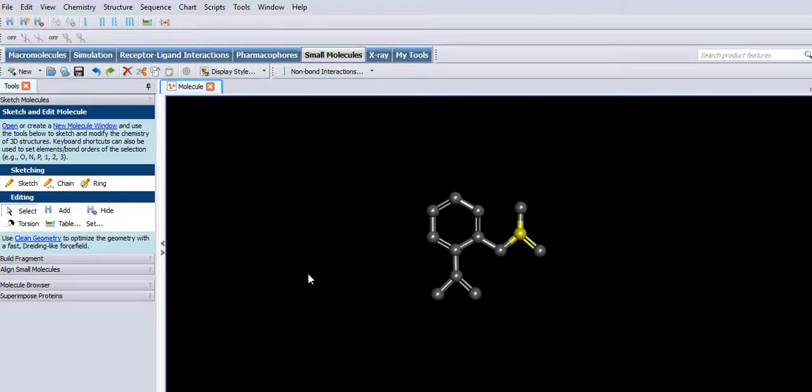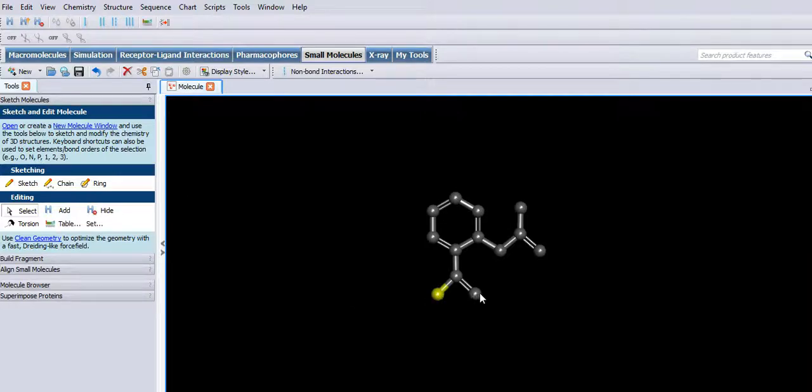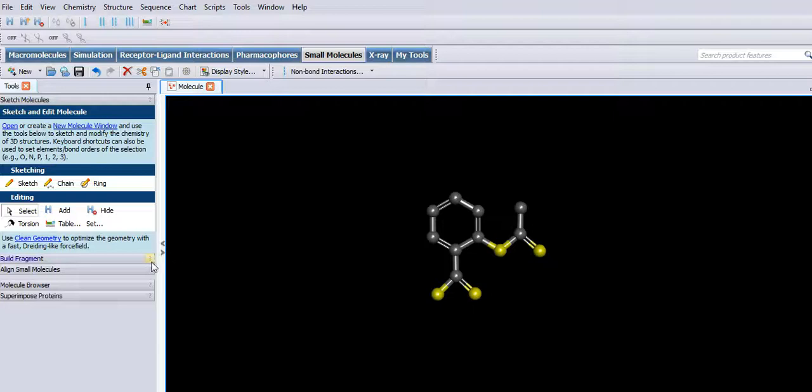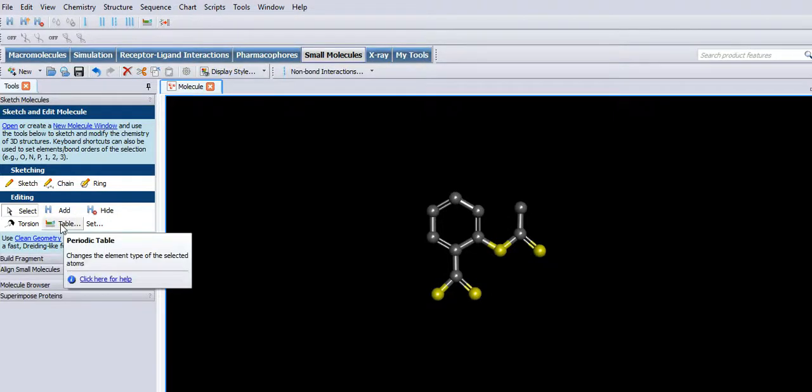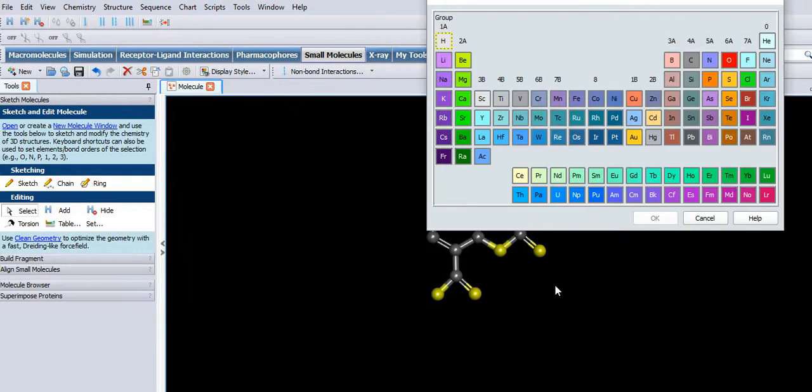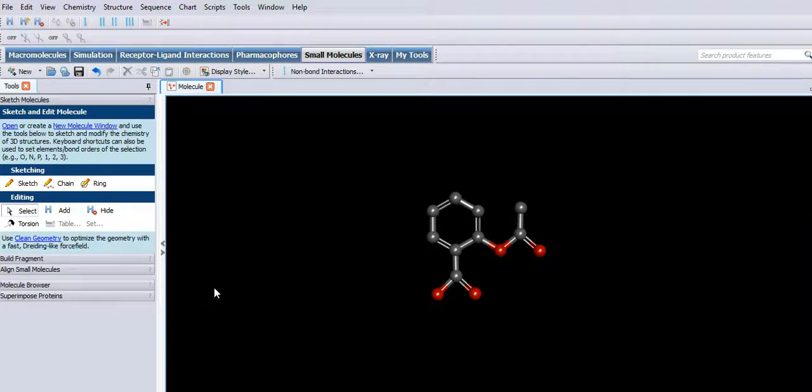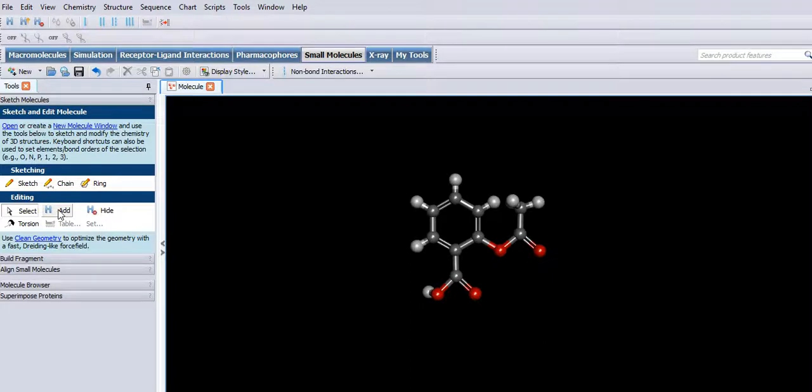Okay, back into select. This time I'm holding down shift. These all need to be oxygens basically. If anything's highlighted, you can manipulate it or move it around the place. So looking for table on the left, go to oxygen, obviously click okay, click okay, and there they are. So we'll just check for hydrogen again, add, and that looks okay.